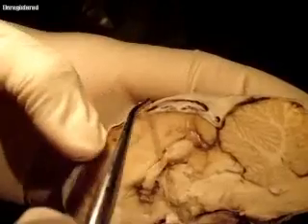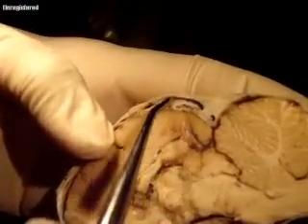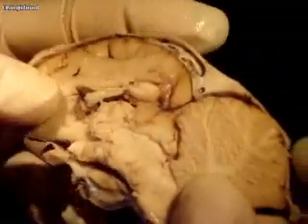This layer is the periosteal layer, and you can feel it's really hard. This layer is the meningeal layer, and this is a dural sinus. See the opening right there? That's a dural sinus. Some more of it right here. Anything else that you need to know in the brain that I haven't told you?